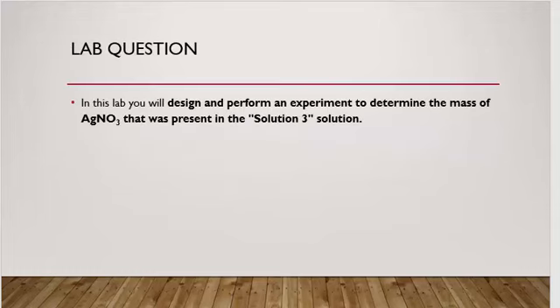Your lab question, if you recall, is to design and perform an experiment to determine the mass of silver nitrate that was present in solution 3. So it's unknown how much the mass of silver nitrate is. But I guarantee you might know something about this mass already.